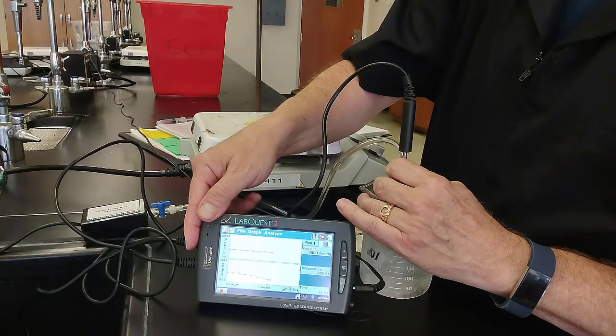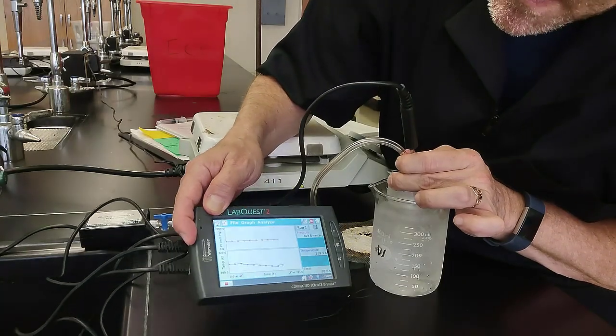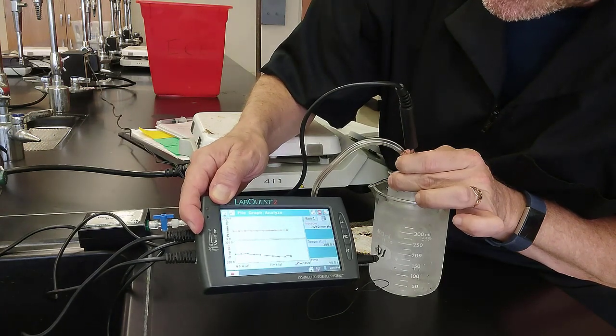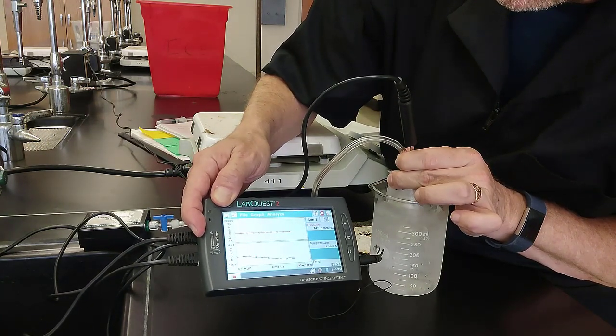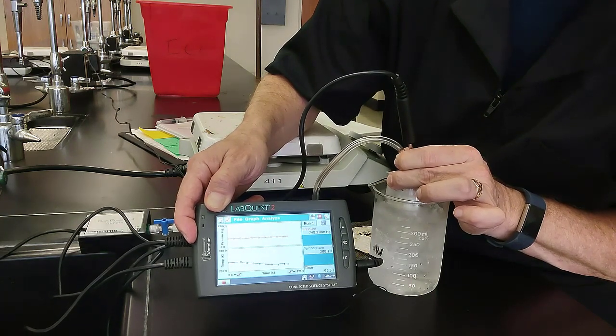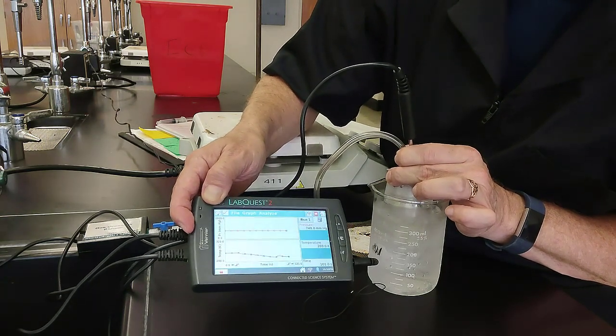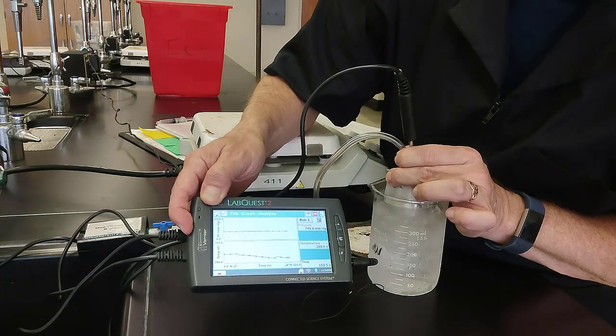Temperature dropping. My temperature is now at 288. You don't need to record these as I'm saying them because we will just go to the XY graph and print it or copy it onto our data sheet. My pressure is now down at 748.